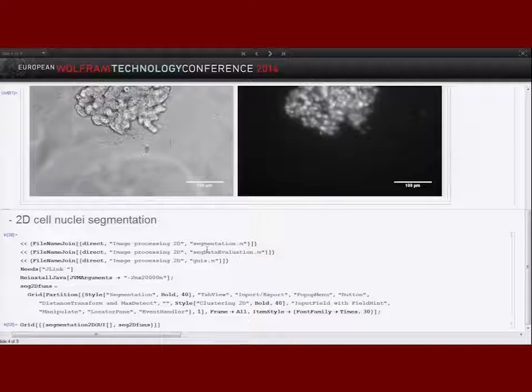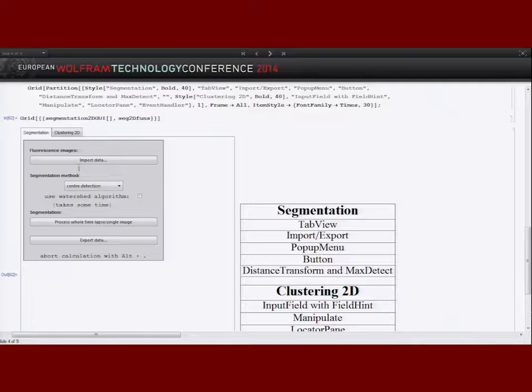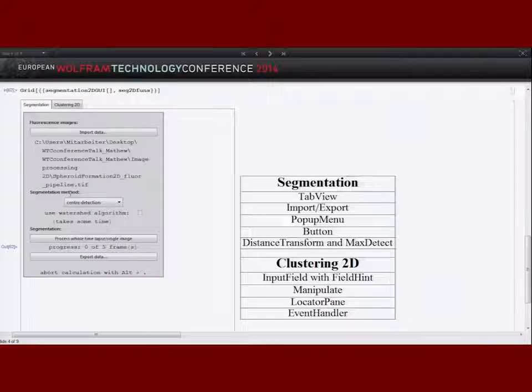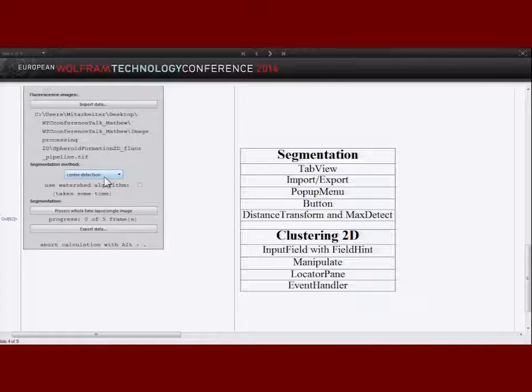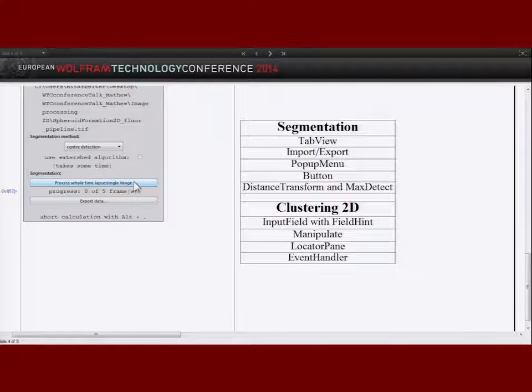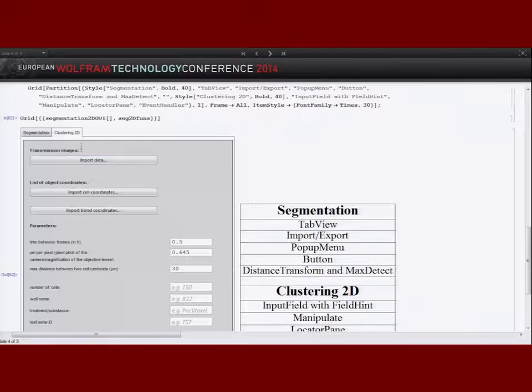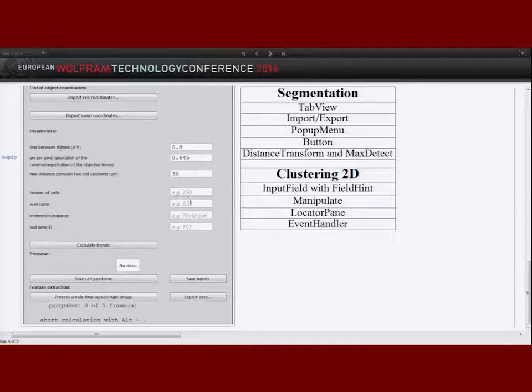The goal of segmentation is to change the representation of an image so that it is more easy to analyze. We developed a graphical interface with a tab view structure where in the first tab we can import images like the fluorescence image. In the middle part we can specify which segmentation method should be used via a pop-up menu — how the cell nuclei should be extracted. We can then process the whole time-lapse and the segmentation method is applied to each image. We can also import the transmission image just for visualization purposes.